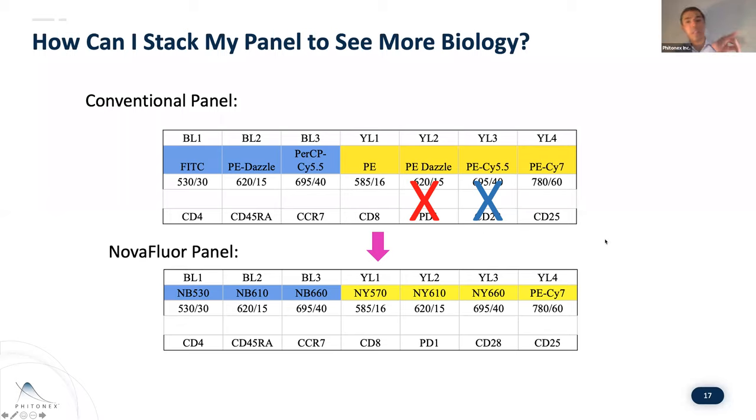I'll pause here because this is mostly said in panel design work. Have I missed anything? Is there anything additional to add here? No, I think you've got it. We've built out actually the violet and the red just to get as much signal to see what's pushing on that system. Yeah, I'll show that in a moment. It's a great point about the violet. I had forgotten that.